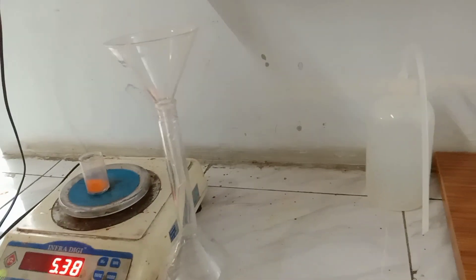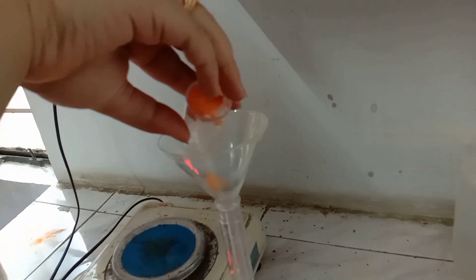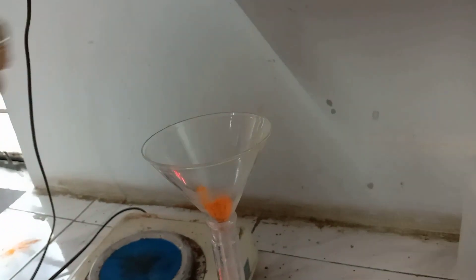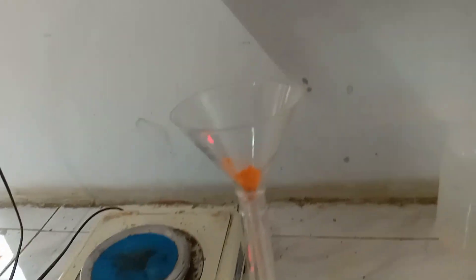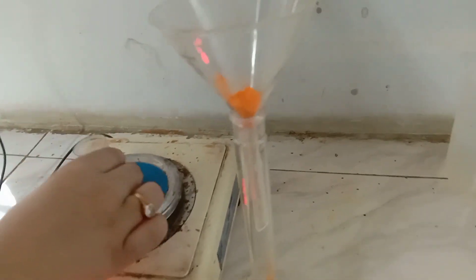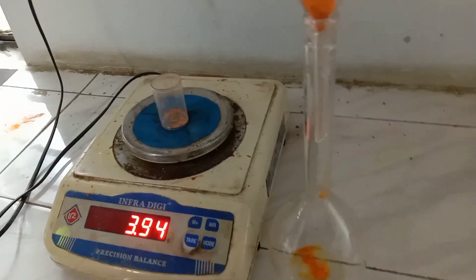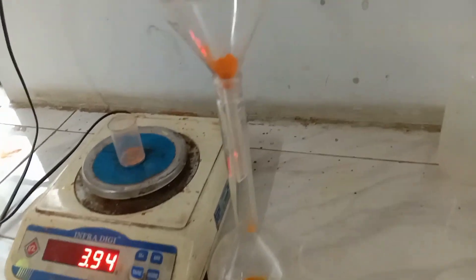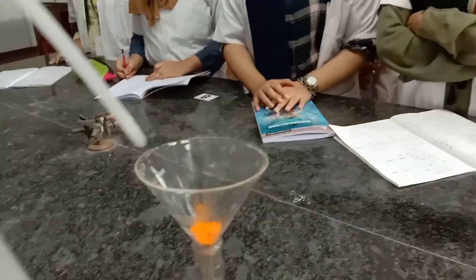The substance is to be transferred through a funnel. Don't forget to take the weight of the empty weighing bottle after transferring the substance — it is 3.94 grams, W3. Now carefully add water, washing the walls of the funnel.